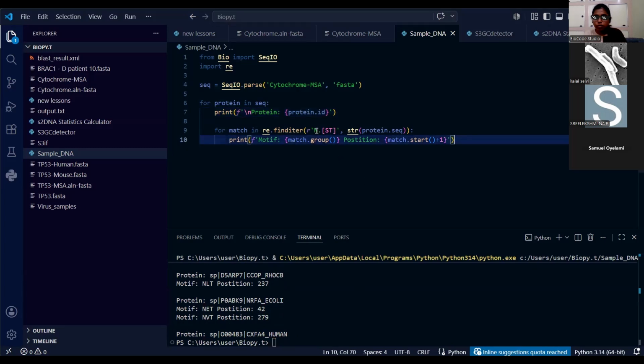Not only N-S/T motifs, there are too many. Whenever you go with a specific work, you have to identify specific motifs. In the format, you can change this one to identify the specific motifs you want. That's it about the motifs.